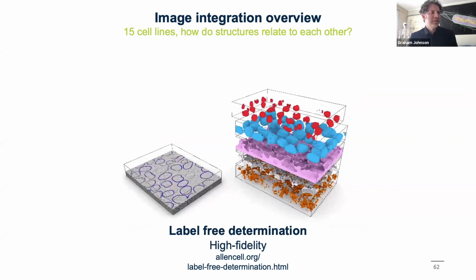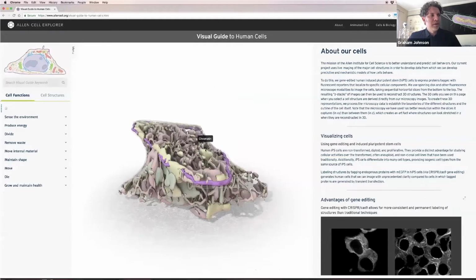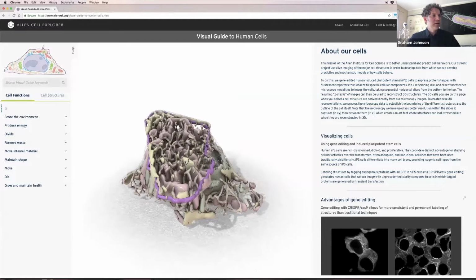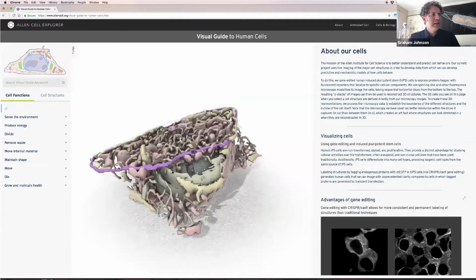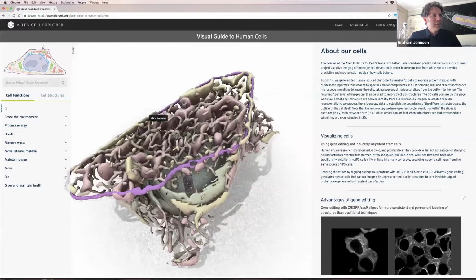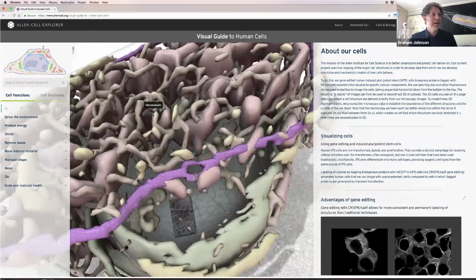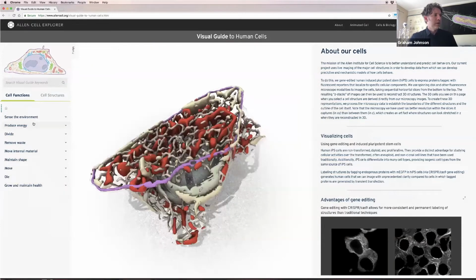And that allowed us to construct a 14-channel model where 3 of the channels are from observed data, including the DNA, the cell surface, and the microtubules. Again, this might be confusing looking because these are microtubules at the resolution of spinning disk 3D microscopy, not at the structural resolution that you might be used to teaching with. I'm going to fast forward this a bit.